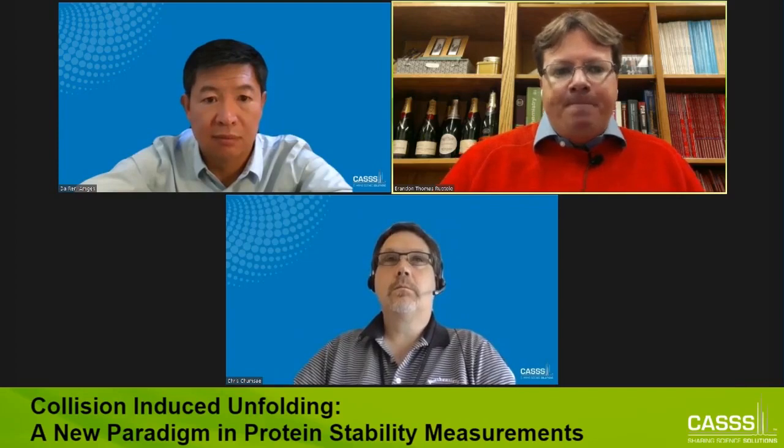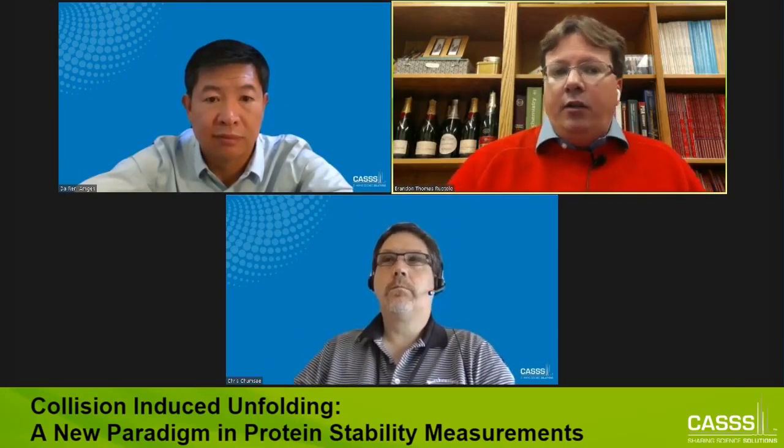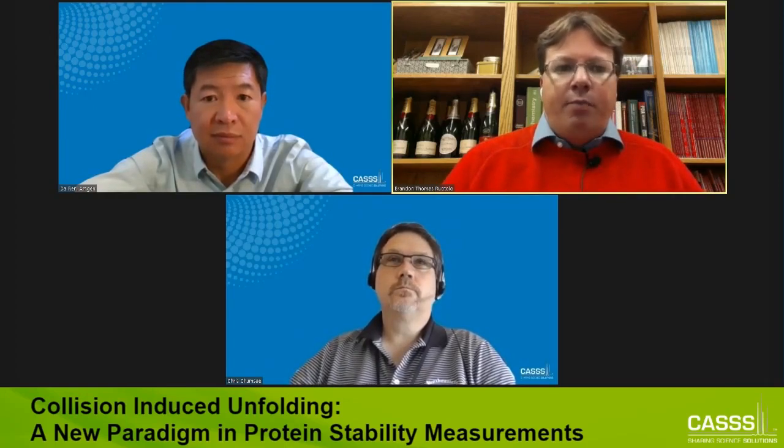The other thing that you can play around with, which we started to do, is using nanoscale electrospray emitters. This is a concept described by folks like Evan Williams, for example, where you can take nanospray tips, which usually accommodate a micron scale exit aperture, and shrink that down to the nanometer scale. That gives you a lot more salt tolerance and tends to give you fewer adducts as a result. And in those cases, you can pump the concentrations up of different formulation components while still maintaining a pretty clean looking spectrum.